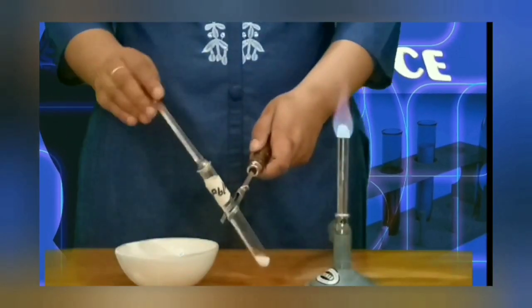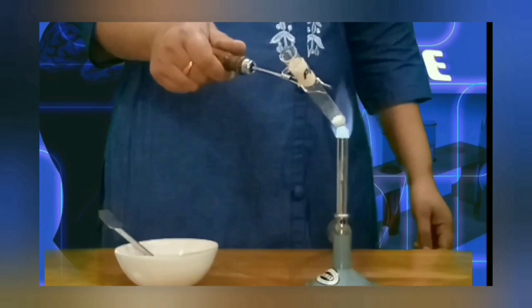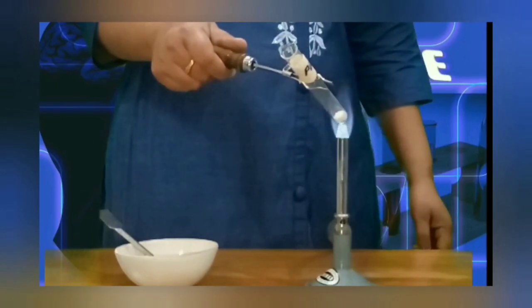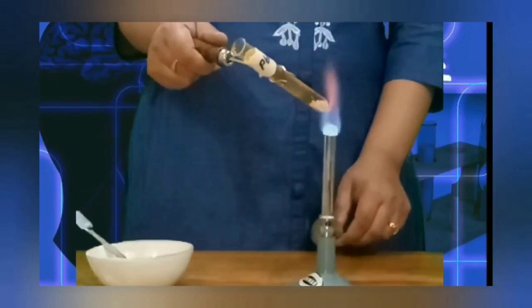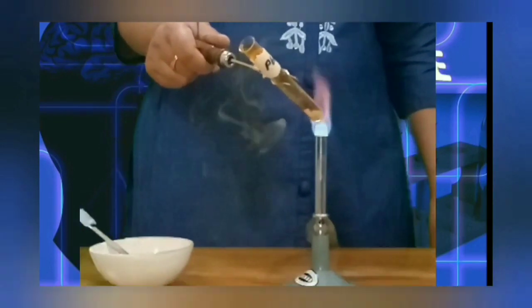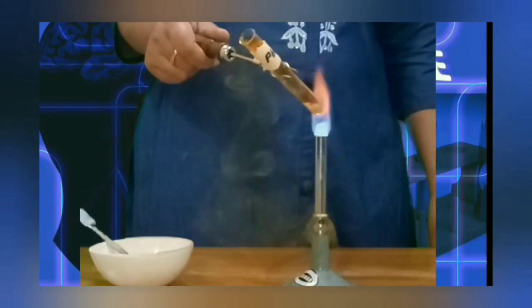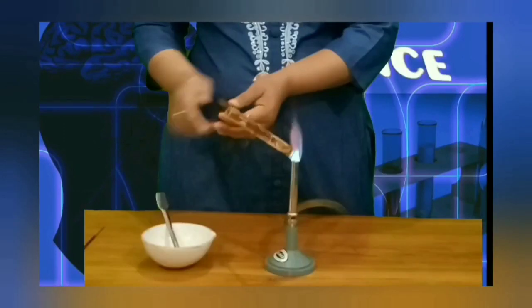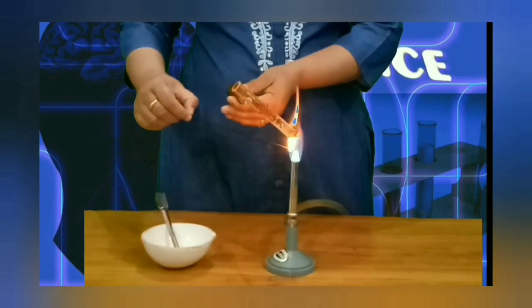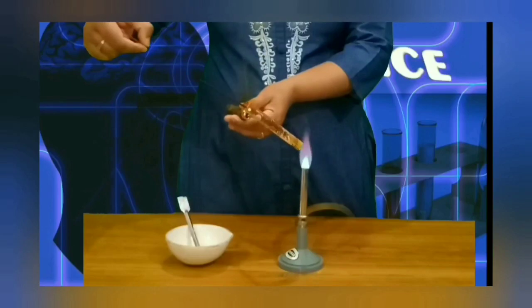Take about 2 grams of the white crystals of lead nitrate in a dry test tube. Heat it over the flame, and care must be taken here. Tilt the test tube away from you to avoid fumes. Observe the heating process carefully. You can see that lead nitrate is producing a crackling sound along with brown fumes of nitrogen dioxide. Let's burn the incense stick, and let's put the glowing stick inside the test tube, and you will see that it reignites.